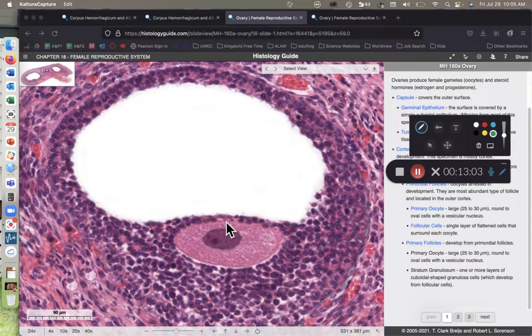And here's the objective way I want you to do this. Look at the longest cross-sectional distance or diameter of your oocyte, and then look at the cross-sectional distance of the antrum. So because our oocyte has a diameter less than the cross-sectional distance of the antrum, we're going to call this a mature or Graafian follicle. Let me clear the screen here.